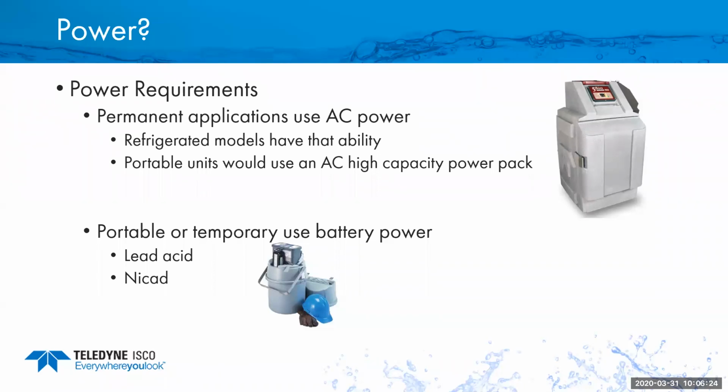You can actually get more charge and recharge cycles out of a NiCad battery than you can a lead acid. You can also totally discharge a NiCad battery, and it's not going to affect the battery at all. They actually perform better if you do fully discharge a NiCad on every use. The main disadvantage of a NiCad is they have a lower capacity, so they just won't last as long out in the field.